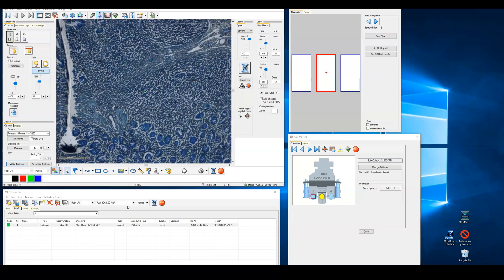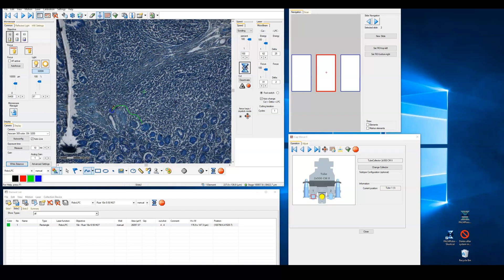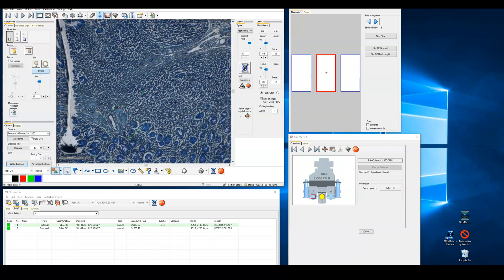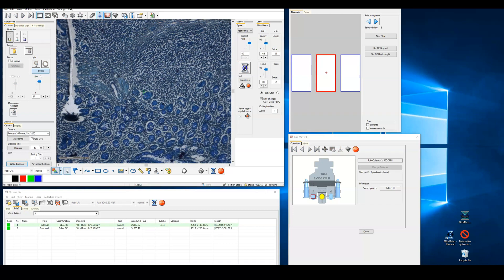From here we simply draw a shape around the portion of the tissue that we want to isolate, and then press on the cut button. Using this particular type of sample where the tissue is mounted on the membrane-covered slide, the cut proceeds from the outside of the drawn region of interest and a defocused laser pulse catapults the sample into the capture tube.